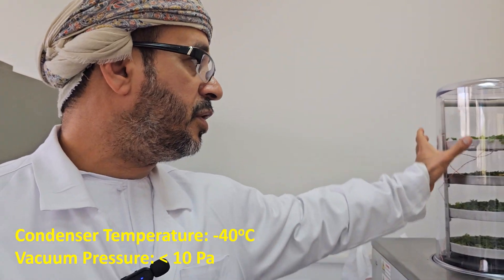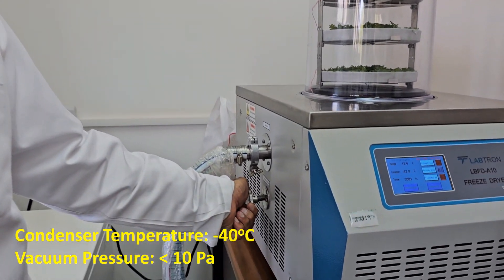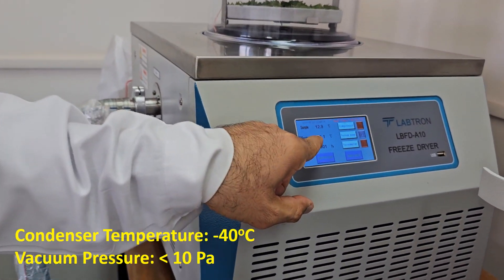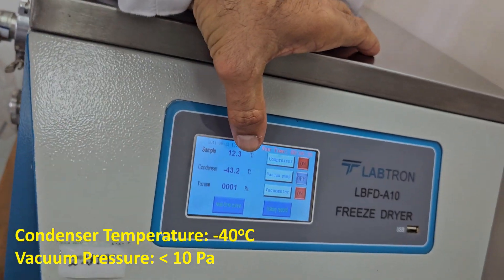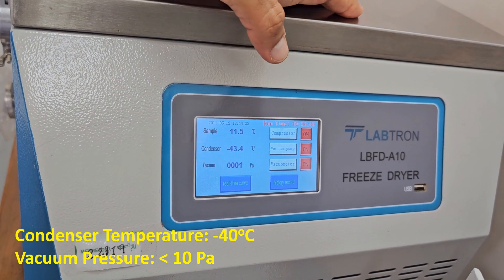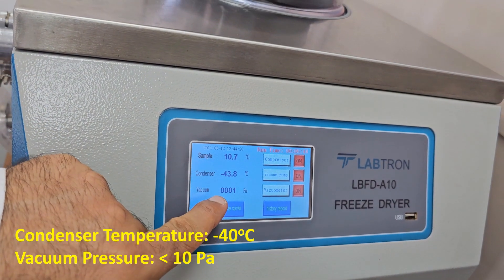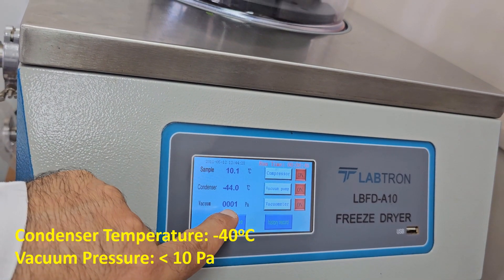After Saleh has put the sample in, you have to make sure that the drain is closed. As we said, the cold trap has reached minus 40 degrees, so we will start the vacuum. Then we just wait until the vacuum meter reaches zero. After some time, this number will start to change.